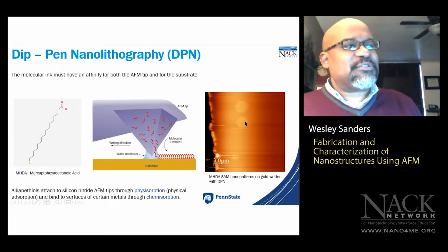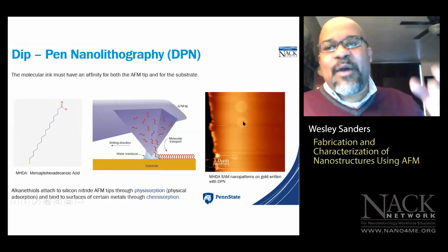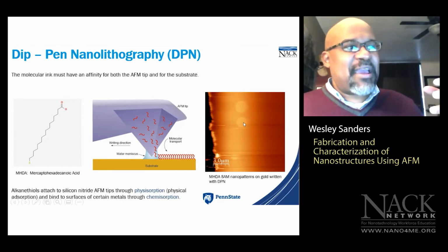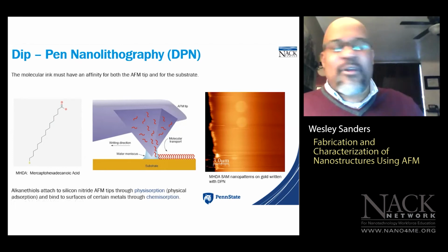So these are two little circles that are deposited using DPN. And once again, I was hoping that these patterns would act as sticky pads that would allow one or two of the bacterial cells that I was studying to stick to these sticky pads. So spoiler alert, it didn't work.